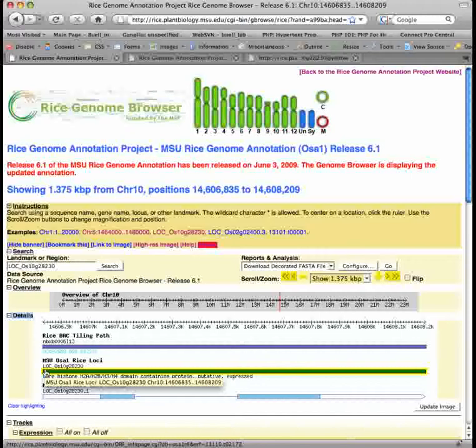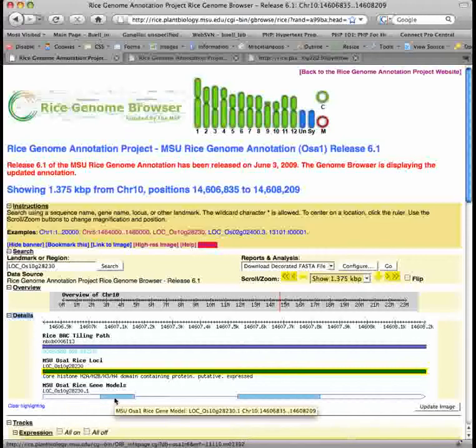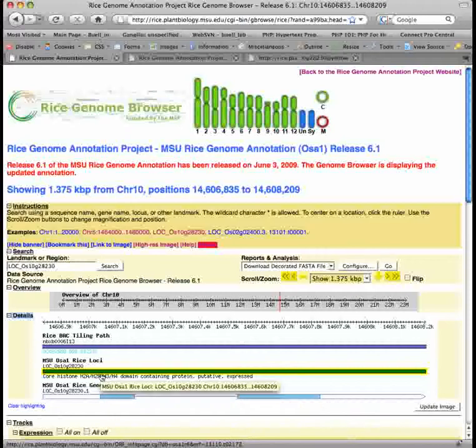This locus includes a core histone domain containing protein which is based on EST, full-length cDNA, MPSS, SAGE, and/or proteomic data. The gene model is shown below the locus. The exons are shown by boxes, and the introns by lines. The non-coding regions are in white, and the coding regions are in blue. You can find more details on this locus on the MSU OSA-1 Release 6.1 Annotation Gene Report page by clicking on the locus glyph.